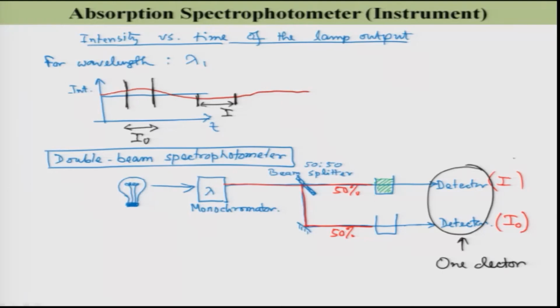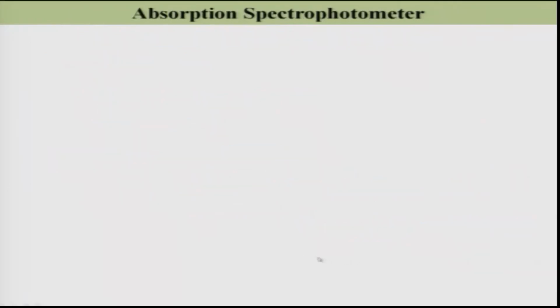So, I need another page over here. The new design that we are going to have is something like this. Now I have this lamp over here. Now I have a wavelength selector.